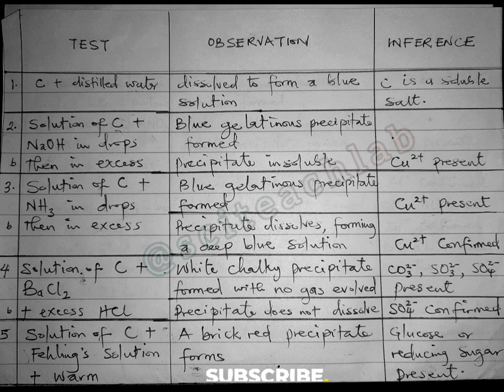It's like gel. It's jelly. It's gel-like or something. So a blue gelatinous precipitate. Precipitate is that stuff that does not dissolve. You find it inside the liquid. It doesn't dissolve. That's a precipitate. But it's blue in color. So you observe everything you see there. It's a blue precipitate, and that precipitate is gelatinous in nature. So it's a blue gelatinous precipitate formed.